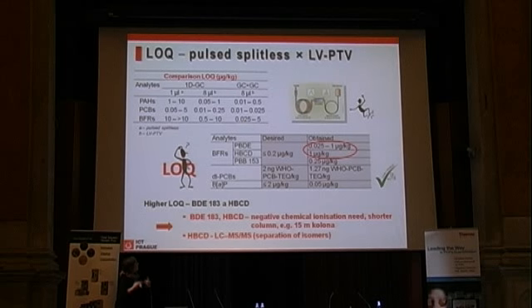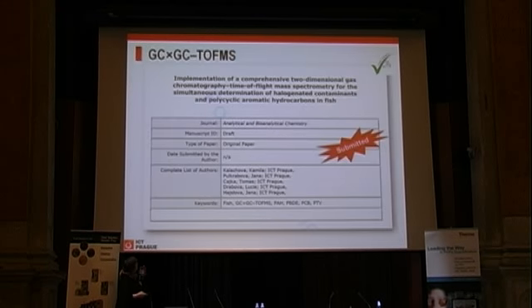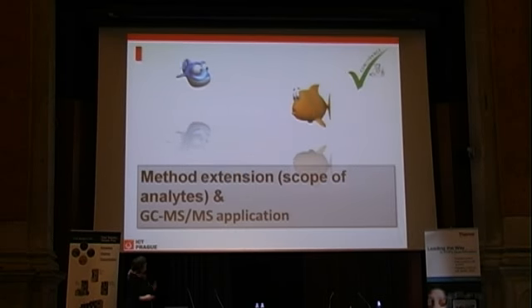So as you could see, indeed, GC×GC TOF-MS is a very attractive technique. And as with everything in our laboratory world, it has benefits and limitations. In our case it was a lot of big data and maybe sensitivity. And at that time we had a new possibility to work with MS/MS. I should say that in 2005 or 2006, when we planned the project, MS/MS was not easily available on the market. And in the meantime, we got the possibility to work with a Thermo instrument, which enabled us to expand the method.